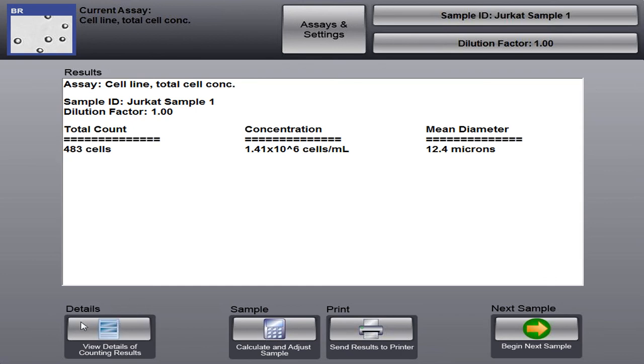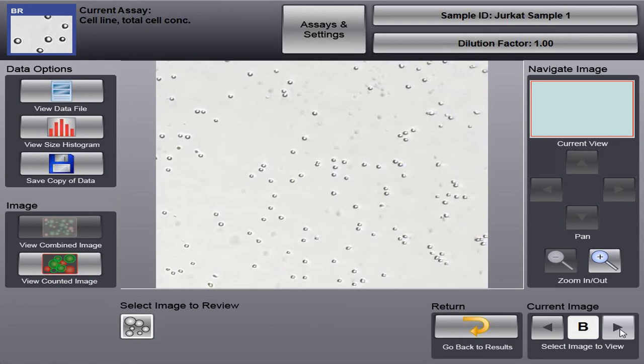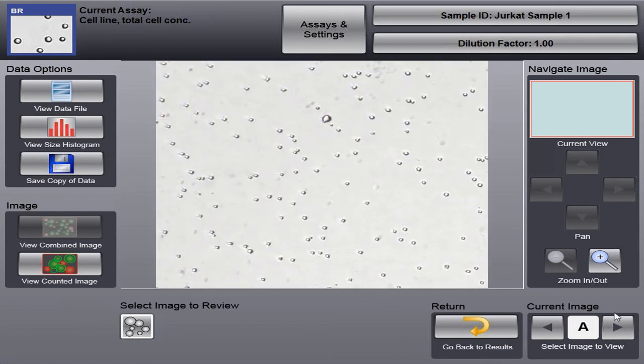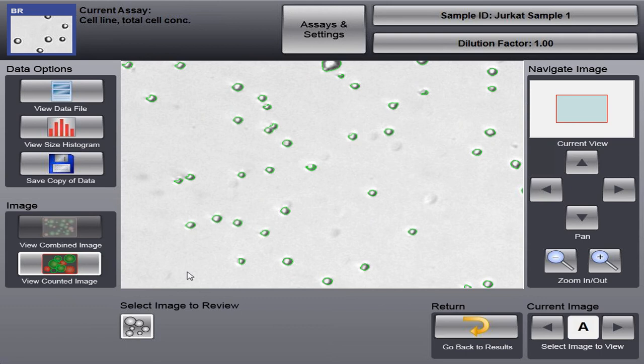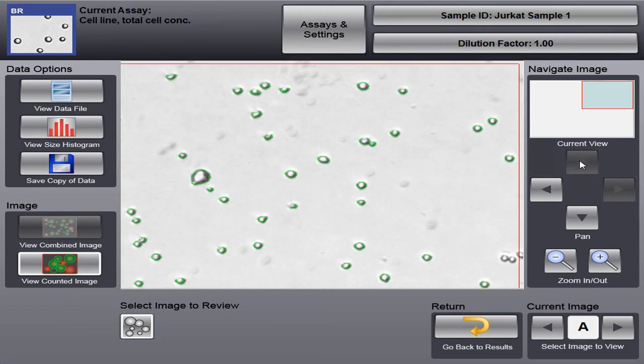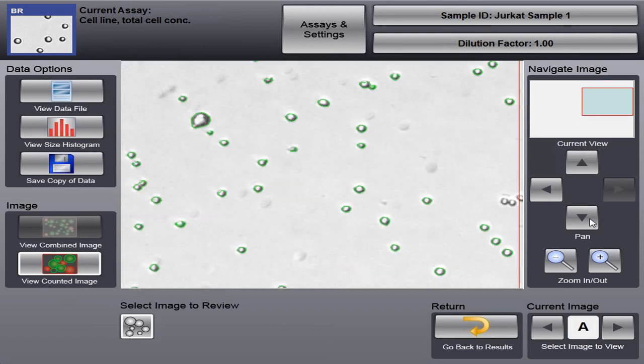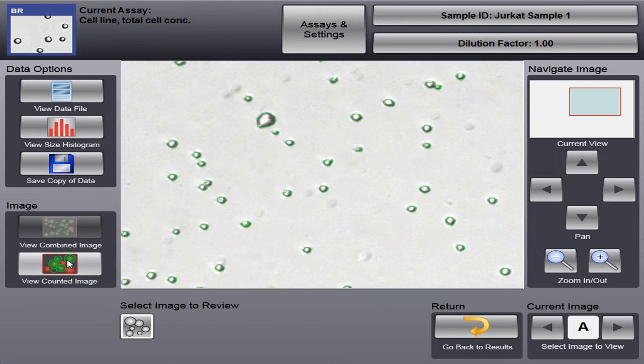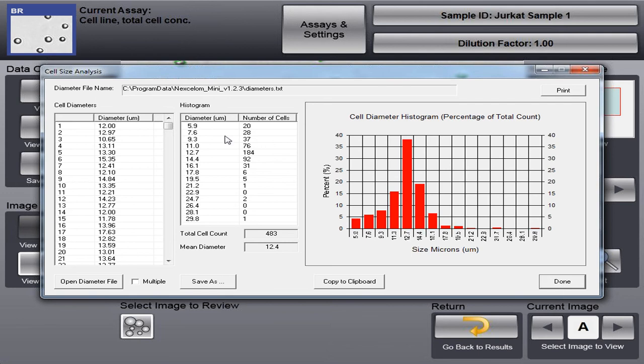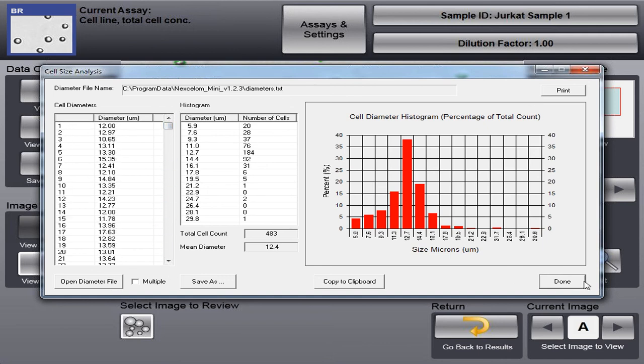So what can we do from here? We have this details button at the bottom left. This brings up our previously counted images. The images we just counted, you can see here A through D. One benefit of being imaging based is we can tell the software to show us what was counted. So you see by clicking this view counted image, we can see all the cells that were counted and they're highlighted in green. Also we can look at our size histogram. So when the Cellometer performs the count, it also does a size analysis. And we see here that the average size is around 12.4, 12.7 microns. And here's just a list of all 461 cells that it counted.